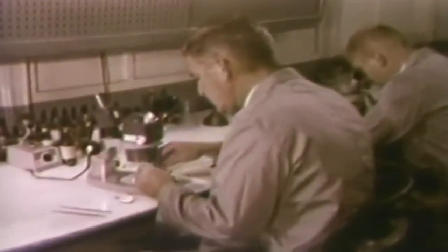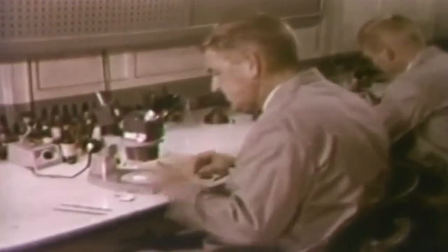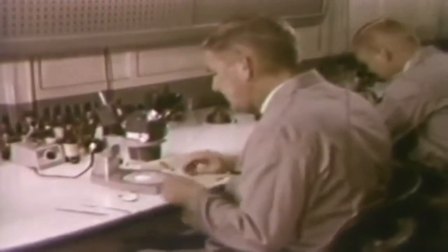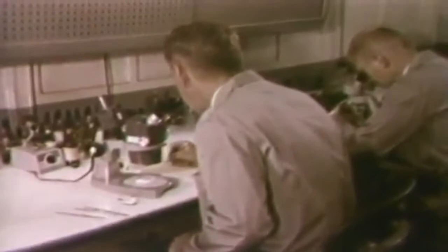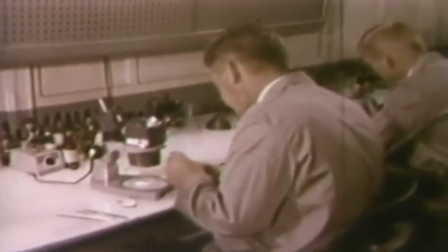The Instrumental Analysis Unit of the FBI laboratory conducts examinations of a large variety of usually small specimens. This tiny paint chip, found at a crime scene, is to be compared with a known sample from a suspect's car. First step is the microscopic examination, which reflects such overall characteristics as color, texture, and layer structure.